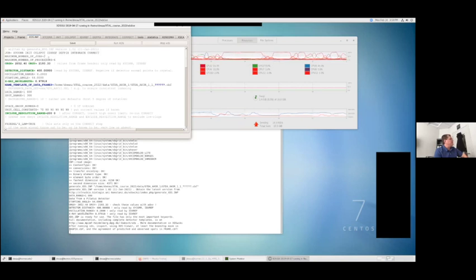You can actually increase this a little bit. So if I have 12 processors total, I could maybe say 4 jobs and 4 processors. Each job will try to make use of the maximum number of processors available. And so you could see that that would try to make use of 16 processors. So even though I only have 12, it can adjust. So you don't have to get this 100% perfect, but you want to be careful.